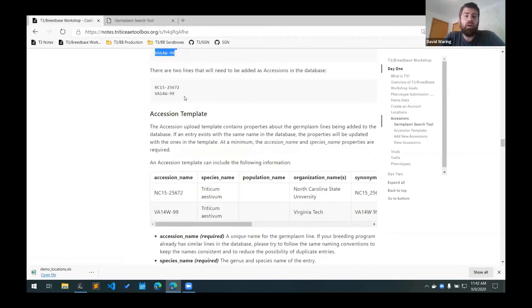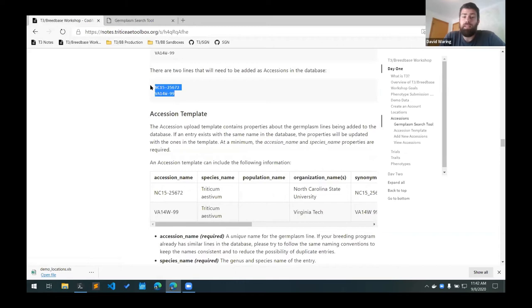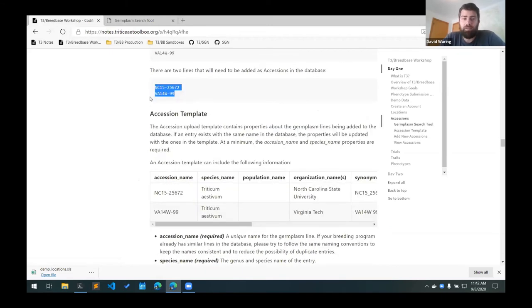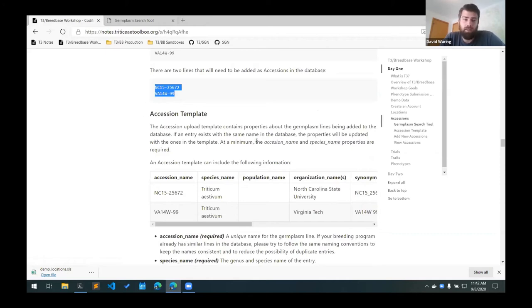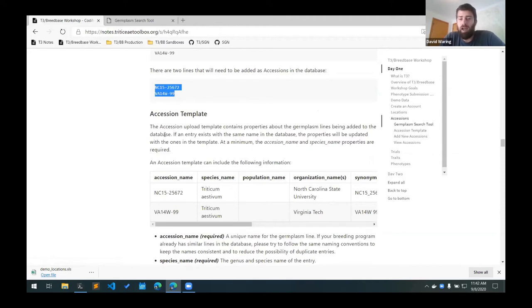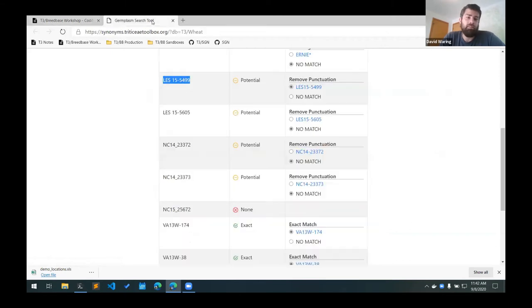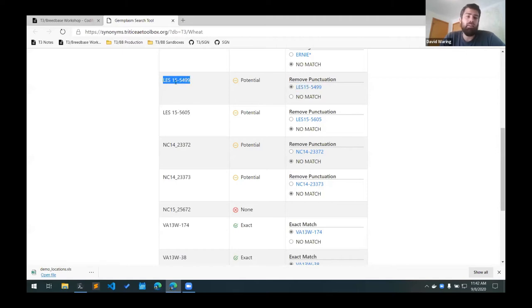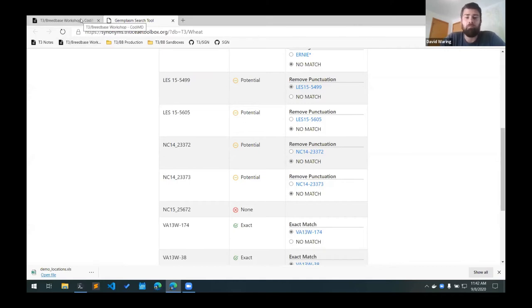So at this point, we know that these two lines are not in the database and that we need to add them. So the way we do that is create an accession upload template. And this will contain all the properties of the germplasm lines that we want to add to the database. If there is a line that already exists with the same name, it will be updated. So in this case, if we had these variations, we would add this as the accession name and we would add this as the synonym and it would add this variation as a synonym for that existing line.